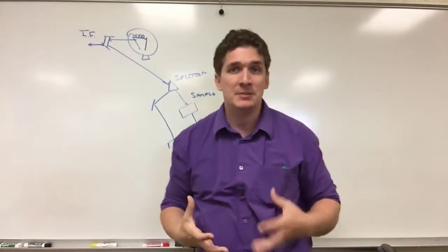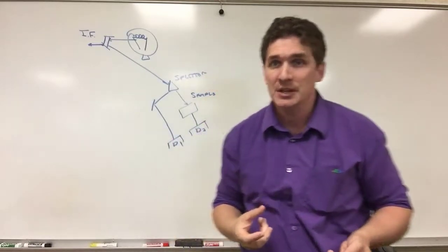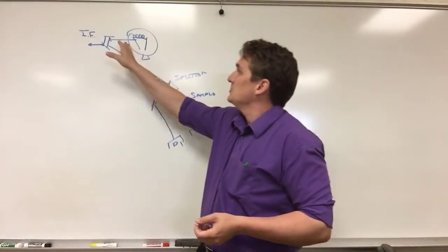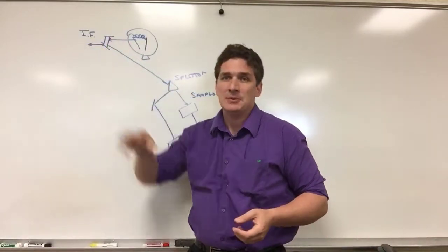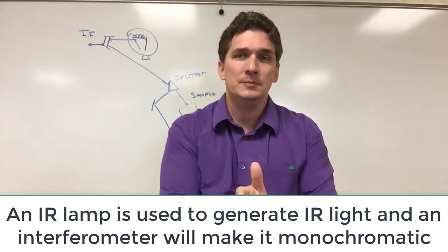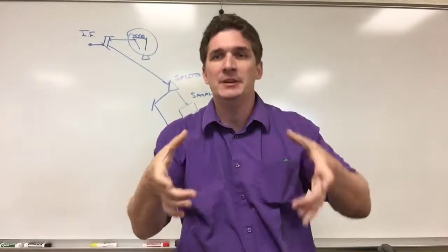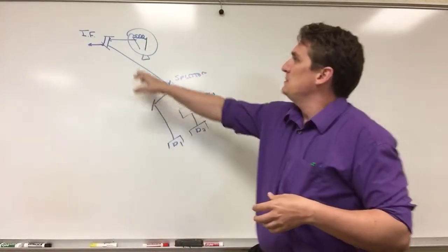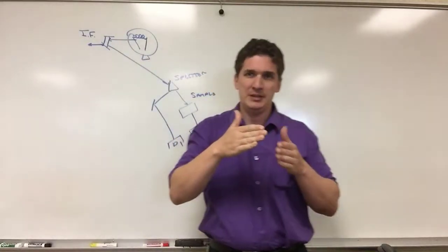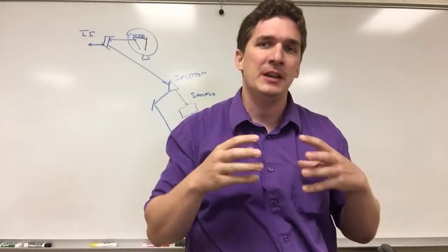Basically, it's a lamp, a bulb that generates infrared light of a fairly narrow range. What we're going to do is pass that light into what's called an interferometer. So, old ones, I don't know if they still do this, is basically a glass cube cut across, basically cutting the cube in half. And what happens is that you pinch the frequencies between two edges, and only certain frequencies are favored at the given angle.